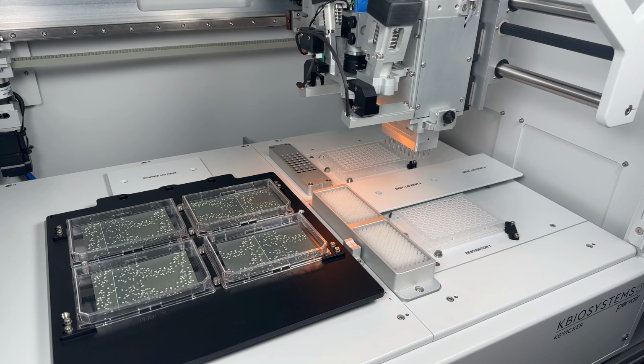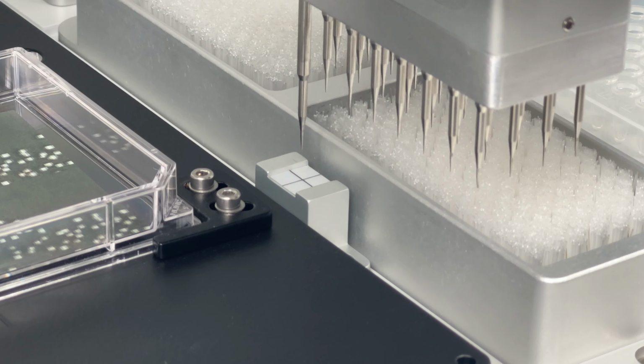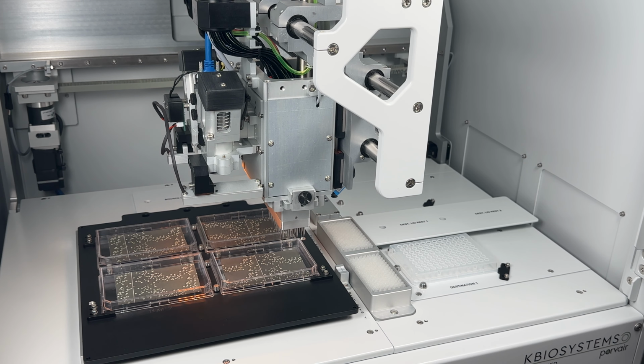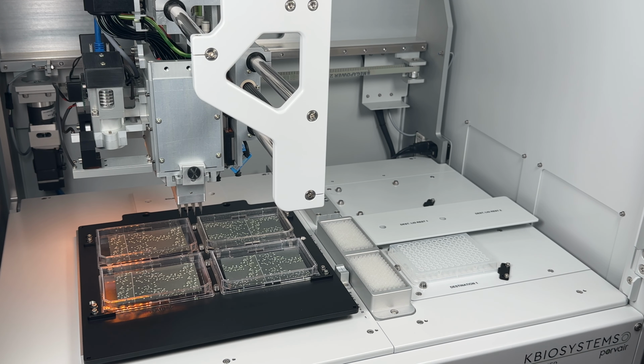The run begins with a calibration to ensure pin accuracy, aligning the camera and the pin with the target. Based off of the spot parameters, the K6 will locate colonies to ensure they match the criteria set by the user. These can all be adjusted to suit various colony distribution.